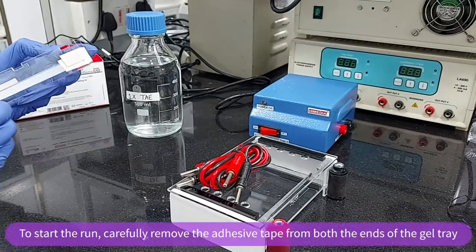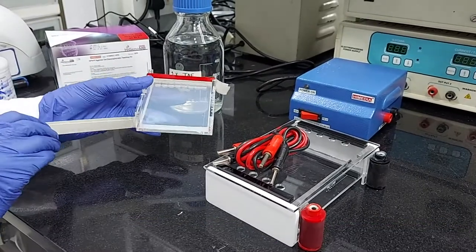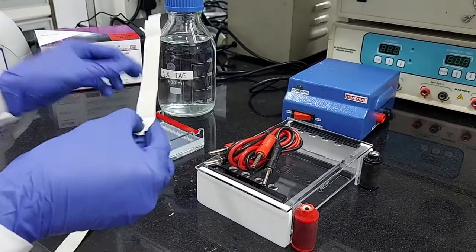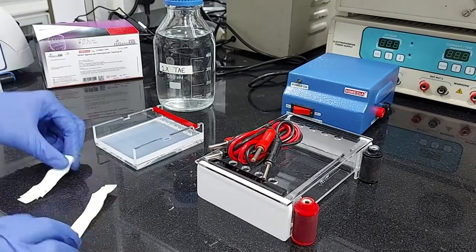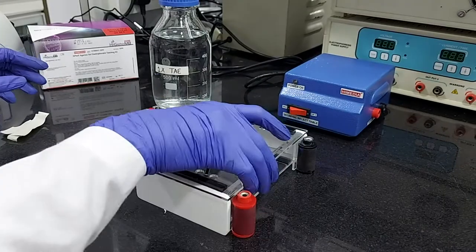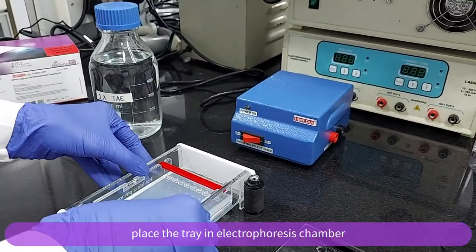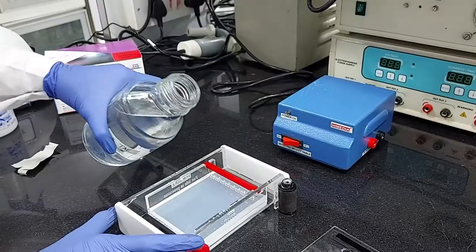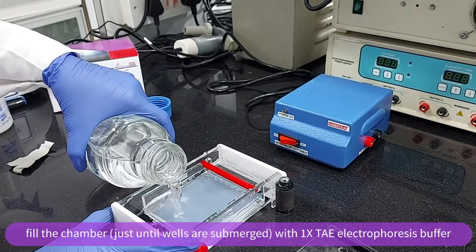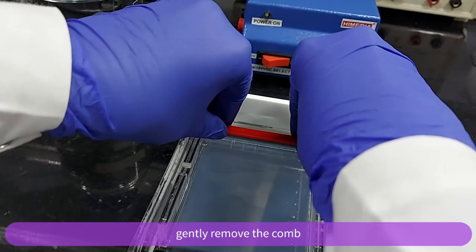To start the run, carefully remove the adhesive tape from both the ends of gel tray. Place the tray in electrophoresis chamber and fill the chamber just until wells are submerged with 1x TAE electrophoresis buffer, and gently remove the comb.